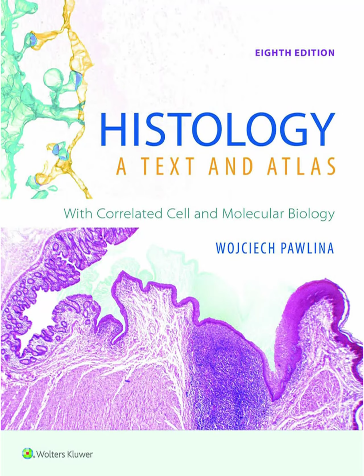Exactly. Within as little as 10 minutes, sometimes even less, that sample is frozen, sliced, quickly stained, maybe with H&E or a faster stain like methylene blue. And a pathologist makes a preliminary diagnosis. 10 minutes? That's incredible. It is. And it allows for immediate, on-the-spot decisions right there in the operating room. It can save crucial time, potentially avoid the need for a second surgery. It's hugely impactful. Wow. Okay, that's a powerful application.